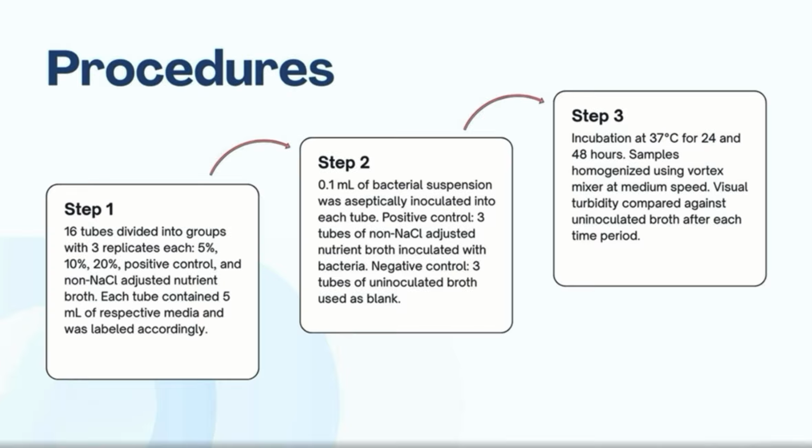Step 3. Incubation at 37 Celsius for 24 and 48 hours. Samples homogenized using a vortex mixer at medium speed. Visual turbidity compared against uninoculated broth after each time period.